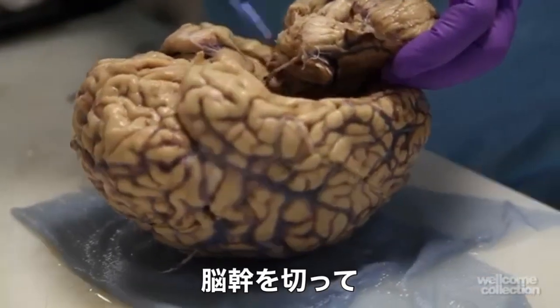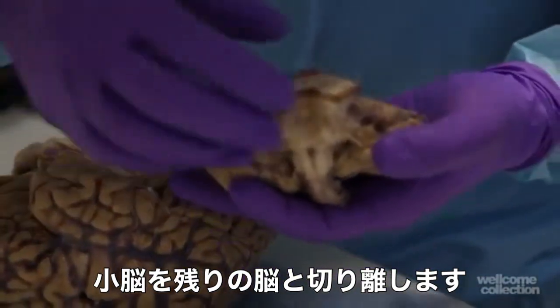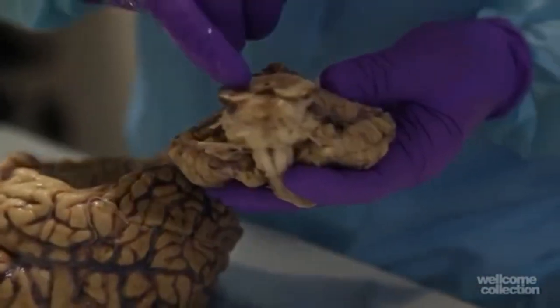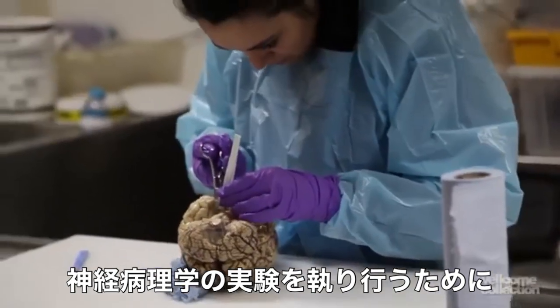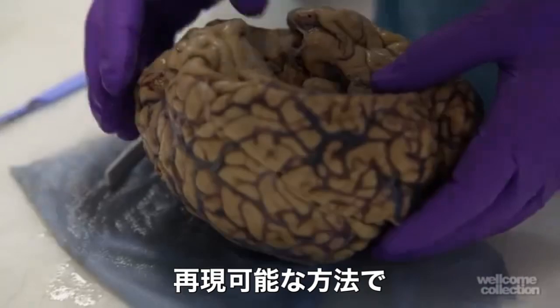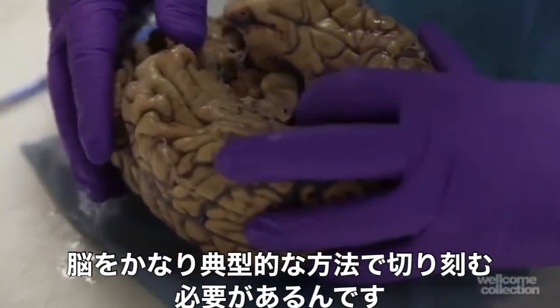We separate the brain stem and the cerebellum from the rest of the brain. In order to carry out the neuropathological examination in a reproducible fashion, we have to cut up the brain in a fairly stereotypical way.